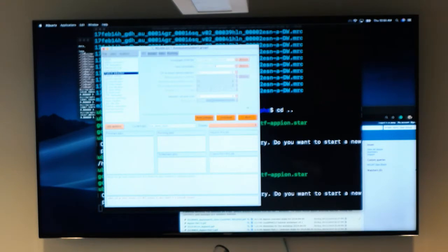But the main thing I wanted to orient you to is that here are several different jobs. There are several different tabs. The first tab usually is where you set up your job. In terms of the extract, just note that the original particle picks were 288 pixels. So you can potentially rescale to any particle size, but if you just want to do a straight bin 2, it's going to be 144. And that's what I'll suggest you do for this initial tutorial.